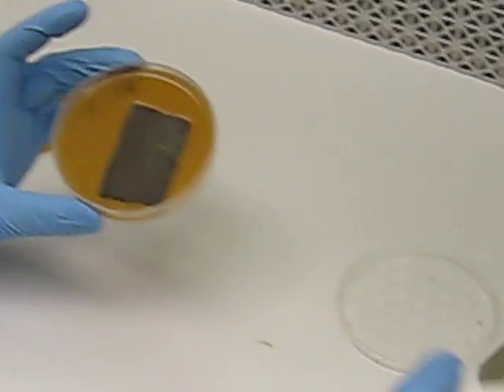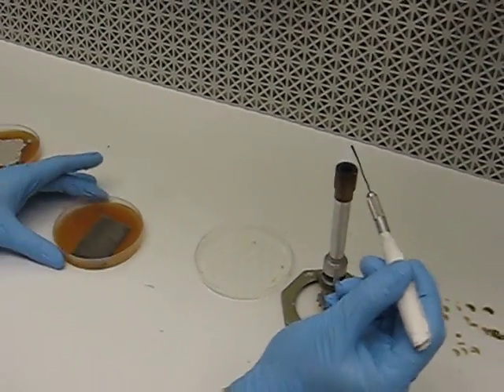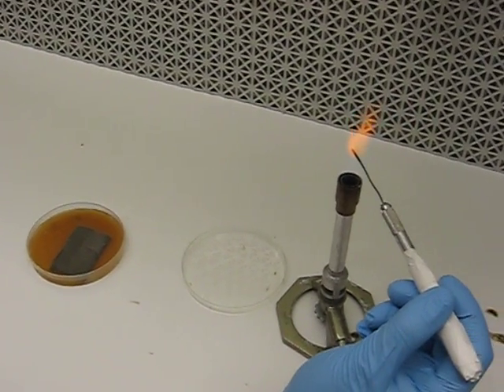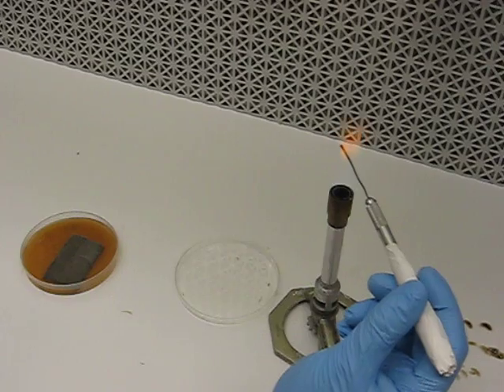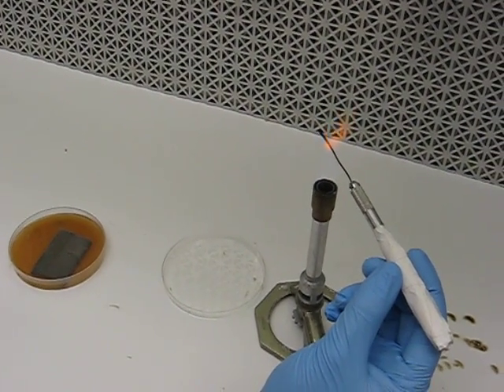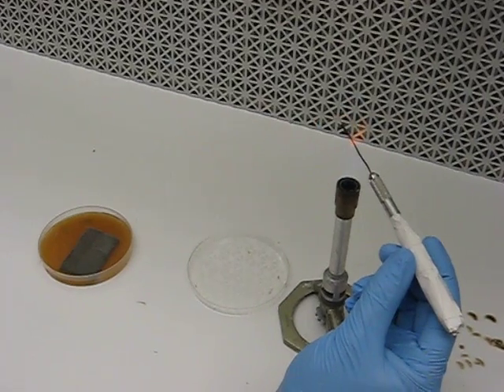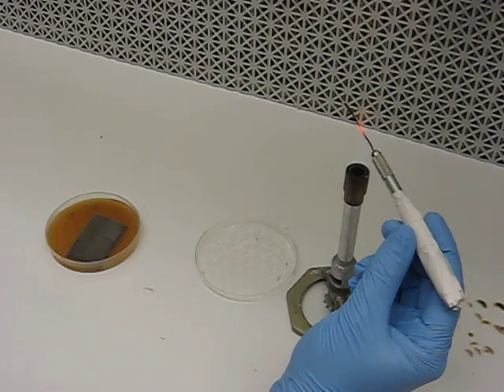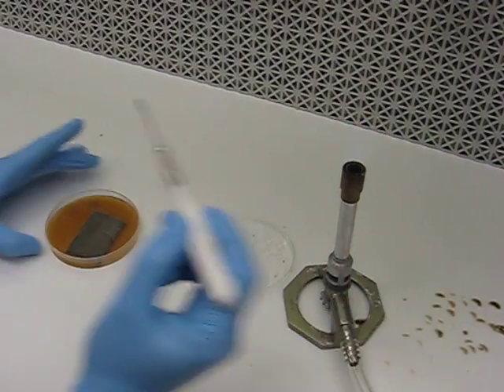When subculturing Cercospora, you always want to heat-sterilize your tool whenever you touch your media. We're basically going to be excising a small portion of the biomass of this Cercospora culture and gently patting it onto our fresh media.